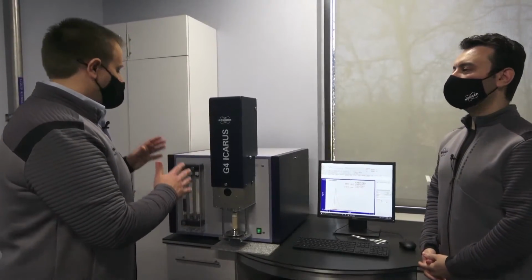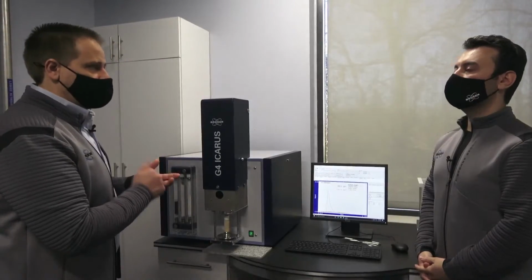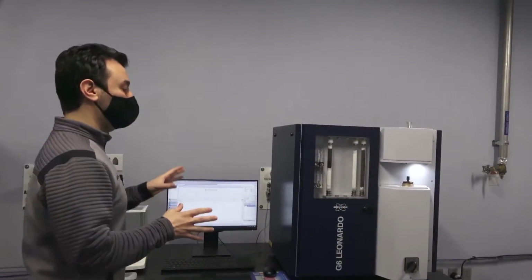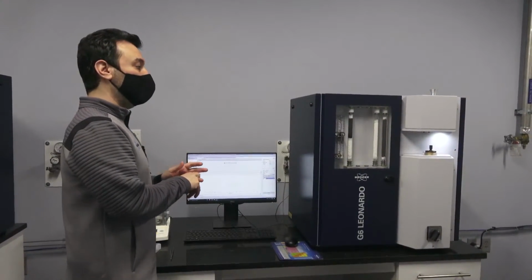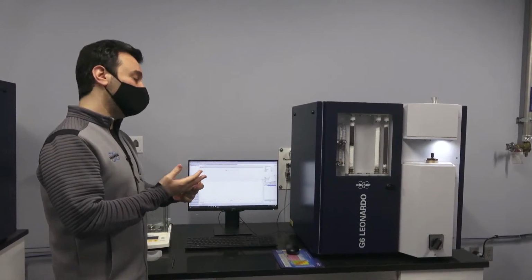Now we also mentioned fusion analysis for oxygen, nitrogen, hydrogen. So if you want to analyze oxygen and nitrogen, and also hydrogen, then you will need a fusion analyzer. This is the G6 Leonardo. This particular unit is configured to analyze oxygen and nitrogen only. It can be configured to analyze either a single element or double element.